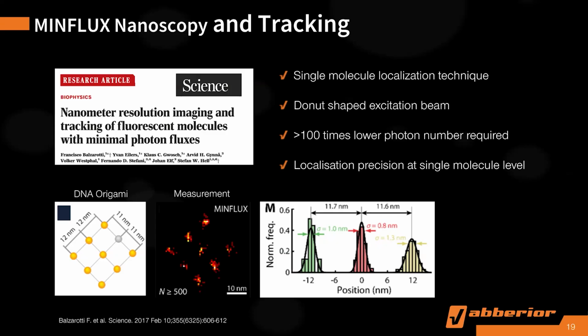If all the bullet holes spread widely, it's not a good system, right? If all the bullet holes are concentrated at the center, then your system is very accurate. We do the same. All the bullet holes from the MINFLUX are coordinates trying to tell where the molecule is.